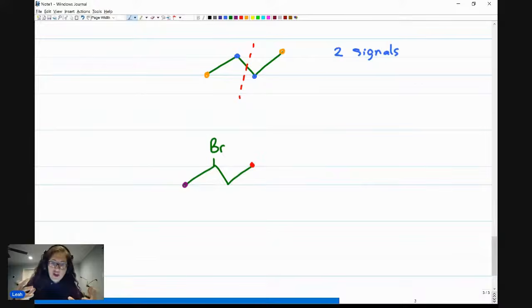And the way the H-NMR machine works is that the electronegativity of the nearby atoms will pull on the hydrogens a little bit. Again, we're not going into the physics behind it, but I'm sharing enough for you to be able to understand why there are differences and therefore be able to easily tell them apart. So the fact that I have no symmetry, the two methyl groups are different, but also every group on the chain is going to be different.